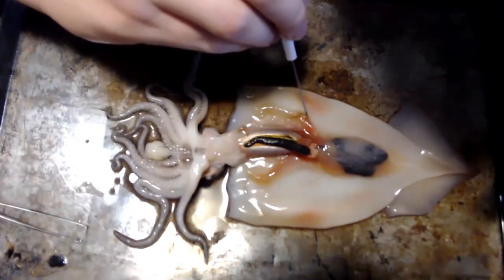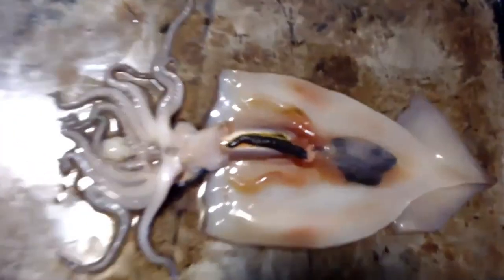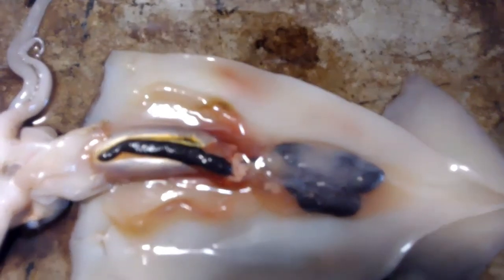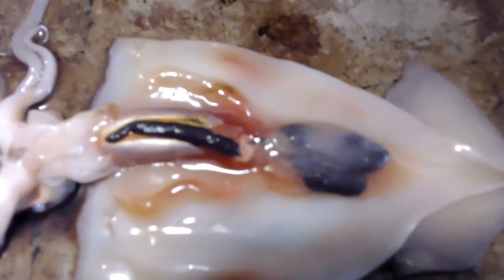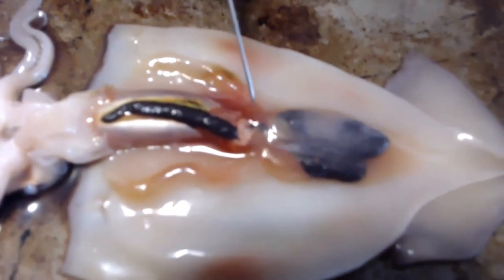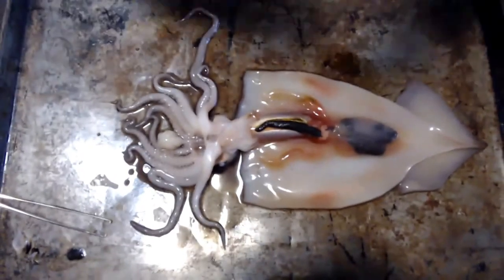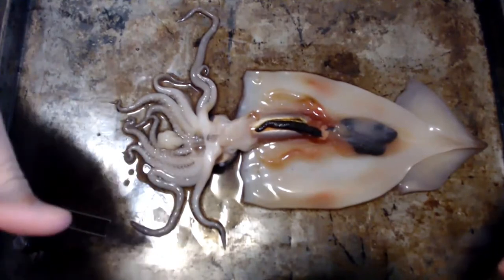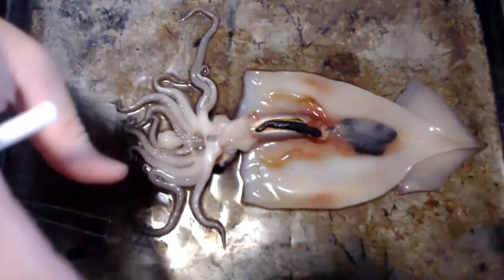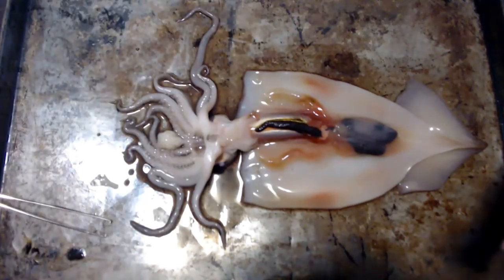I want to show you guys the systemic heart and the branchial hearts. Right here you have two blobs — like gooey, snotty-looking blobs. These are the hearts. There's going to be a heart right here and a heart right here — those are the branchial hearts. Then right in the middle you're going to get the systemic heart. The branchial hearts help push the oxygen through the body to the systemic heart. Then the systemic heart takes over, and they all synthesize together — the systemic heart pumps the oxygen and the blue blood throughout the whole entire body.